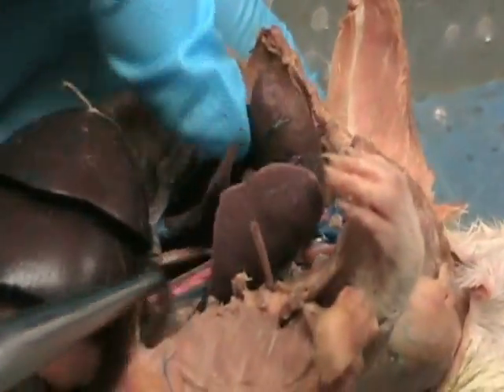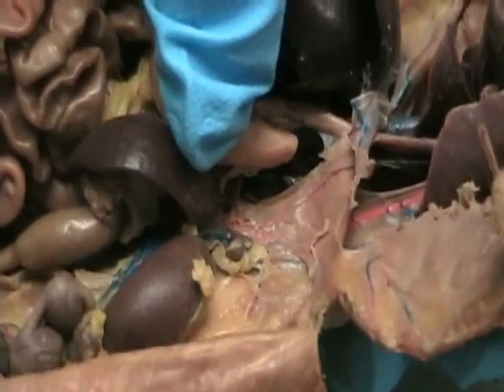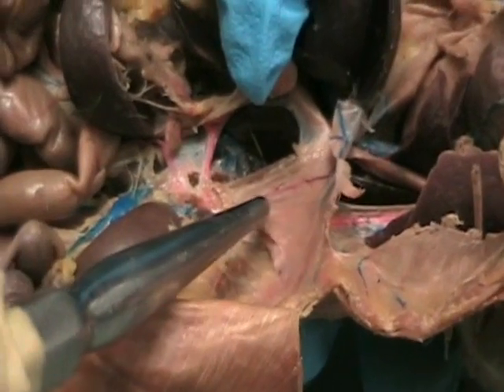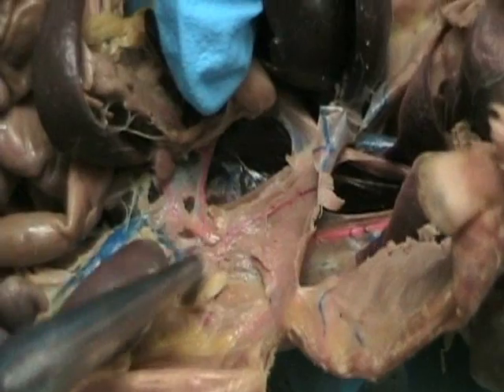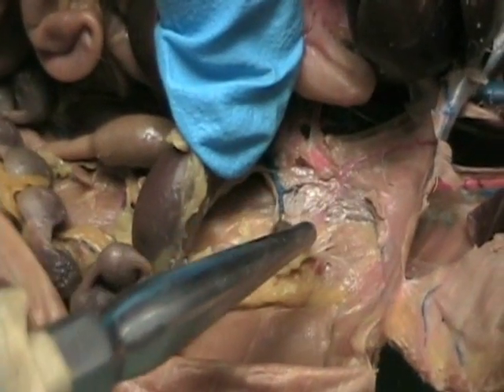Alright, so let's continue down. This one's kind of obliterated, but this used to be a diaphragm. And off of here, your first branching point is going to eventually lead to an artery that goes to the diaphragm and an artery that goes to the adrenal gland. If I see pink in the diaphragm, that's the phrenic artery. Okay? And the phrenic artery branches from a point that will eventually give rise to the adrenal artery.